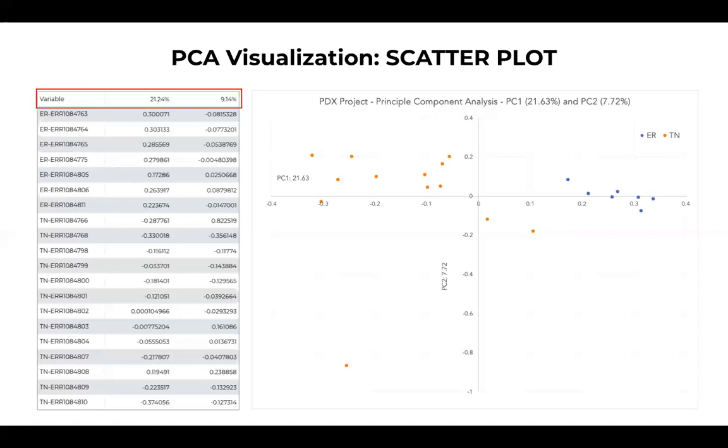So essentially, each dot here represents the number of reads multiplied by the influence of each corresponding gene on the overall variation in expression. I think this is quite confusing, but what I'm trying to tell you is that these dots are coming after learning about the variation in the data, and then PCA is trying to make meaning out of it, that these are the important samples, and these are the genes.